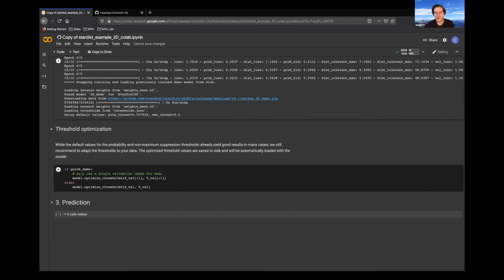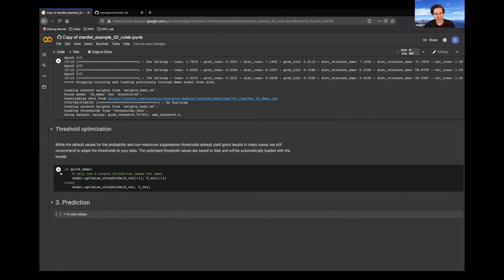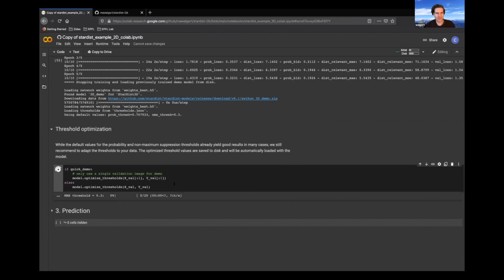So we do a quick sweep optimizing this threshold based on your ground truth. This will be done automatically, and it will find the best thresholds. This is done in this little code cell. We optimize those two thresholds that are actually buried inside of StarDist, and it will do that automatically based on getting the best accuracy on your validation set. Okay. And this may take some time. You see it will try certain non-maximum suppression thresholds, and here is the updated best accuracy that it can get.